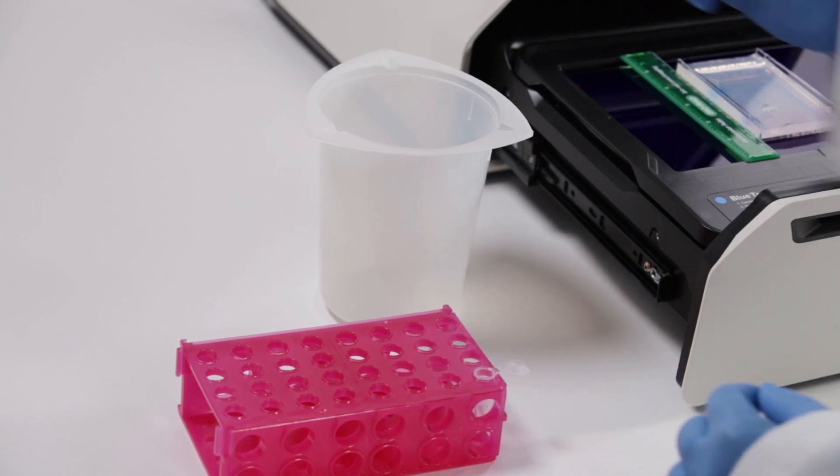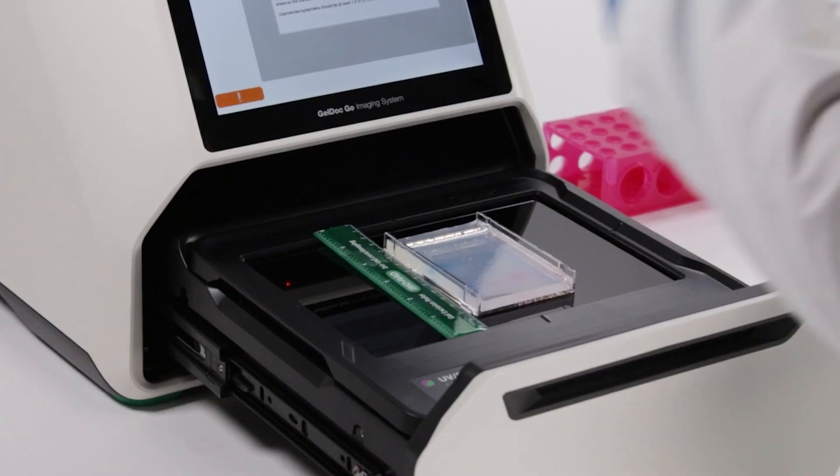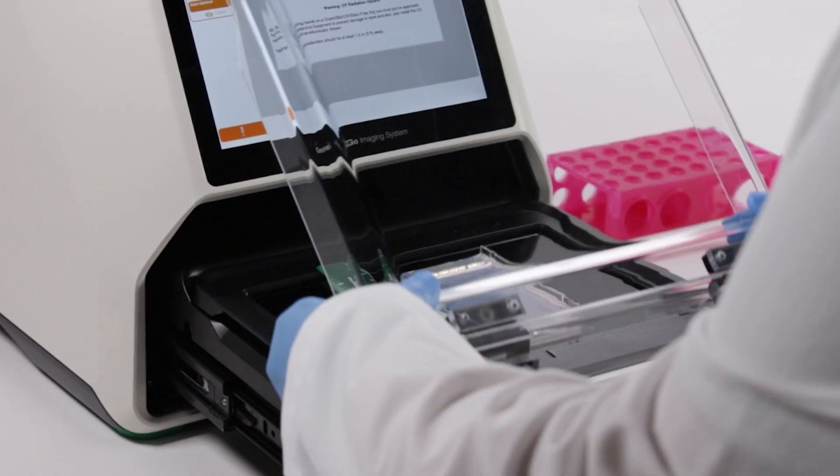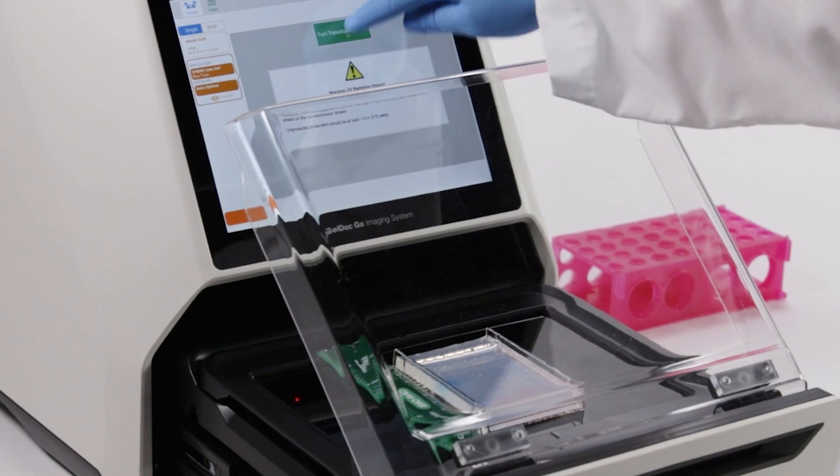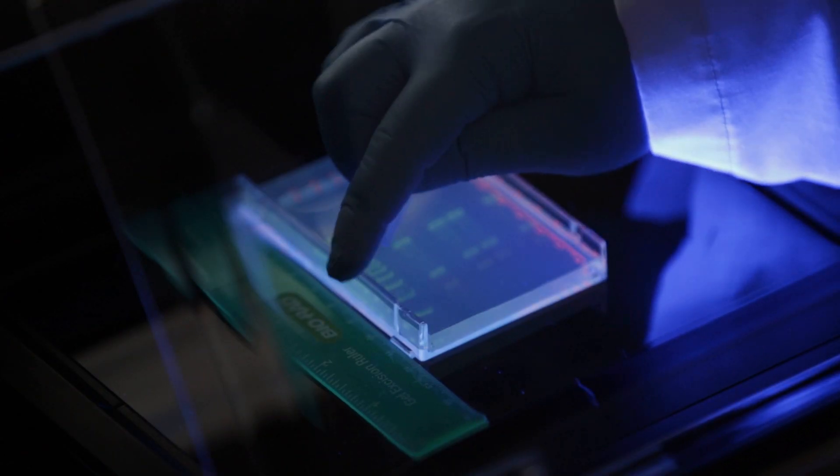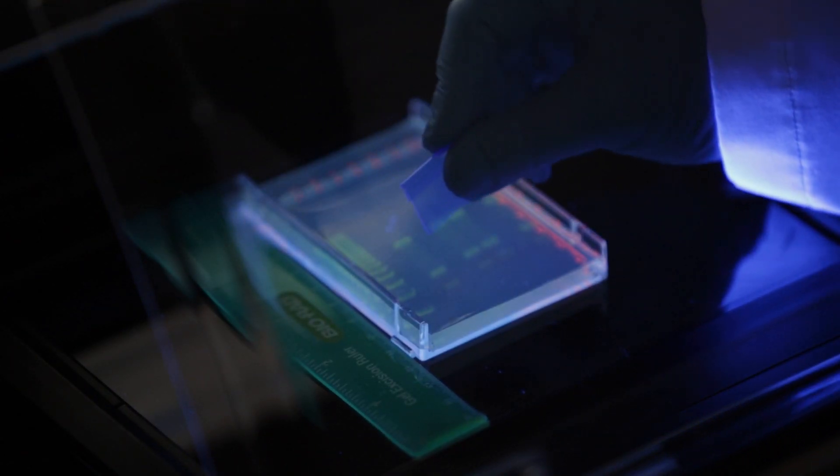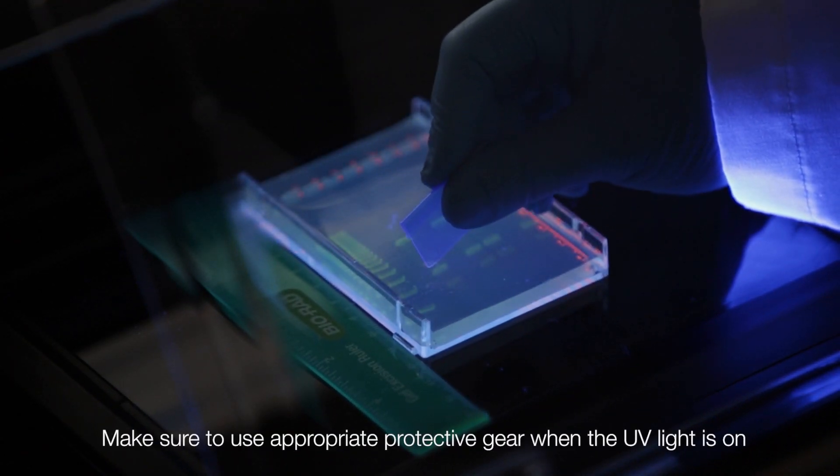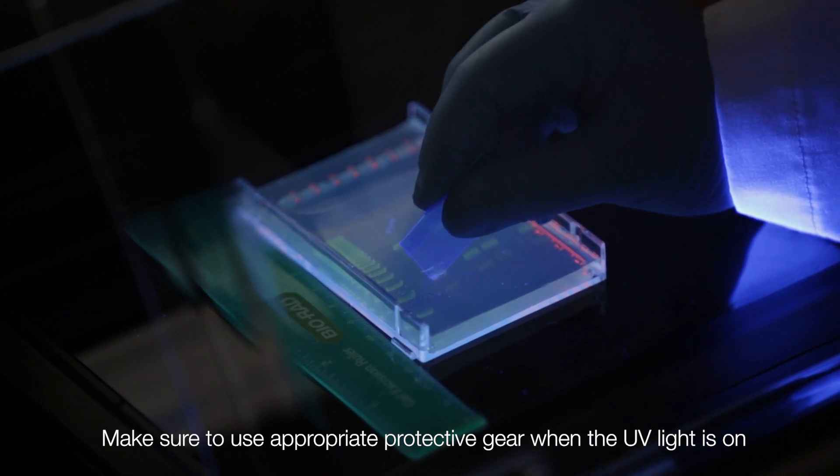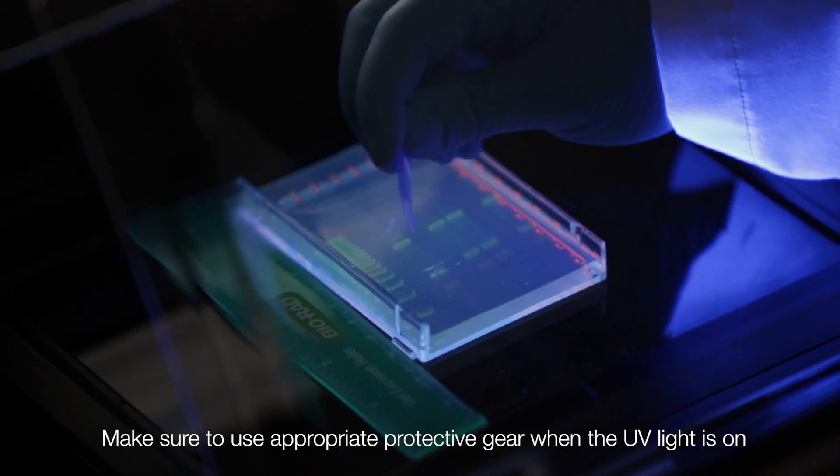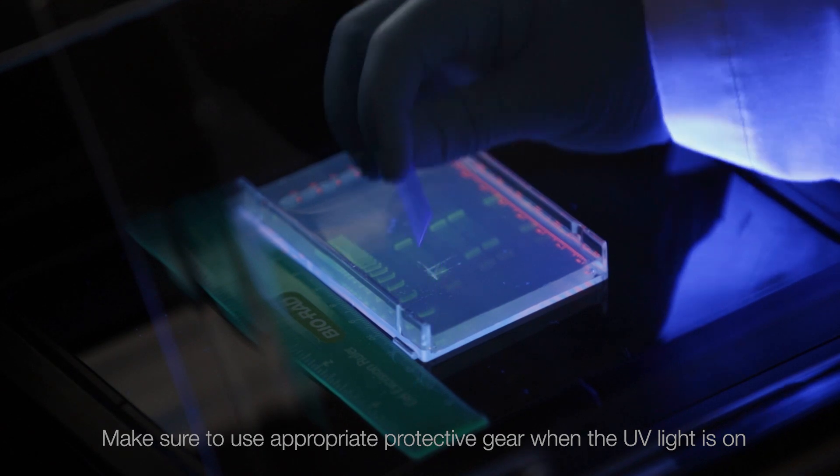Throw away the used cutting tool. Another option is to use the UV tray to locate the bands of interest. Before using the UV light, make sure that a UV shield is installed and that you are wearing appropriate protective gear.